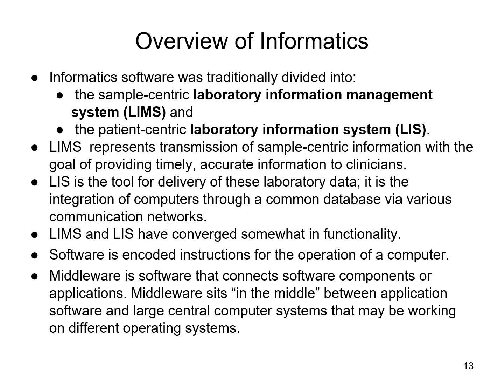And so there are a lot of operations involved in this, a lot of different software coding that's involved to make sure that all of this stuff communicates. And so the middleware is the software that connects these software components and applications in between things like the instruments to the laboratory information system to the overall electronic health medical records to get those results back to the physician's office or into the patient's chart in the hospital.